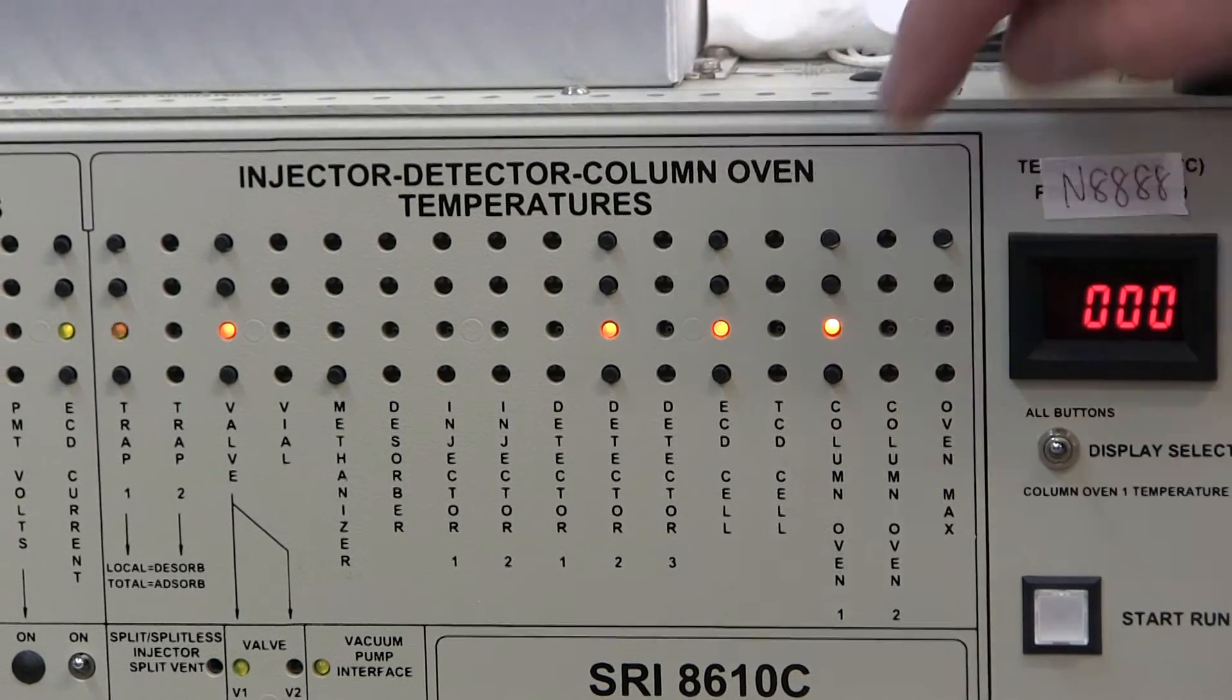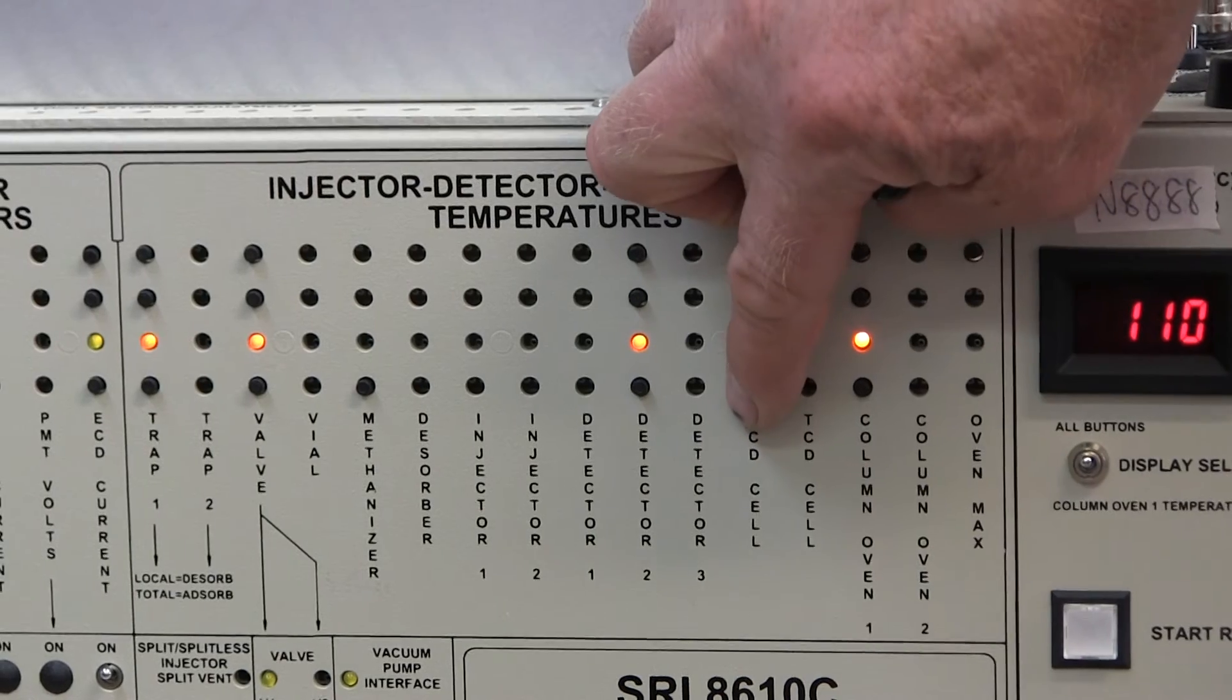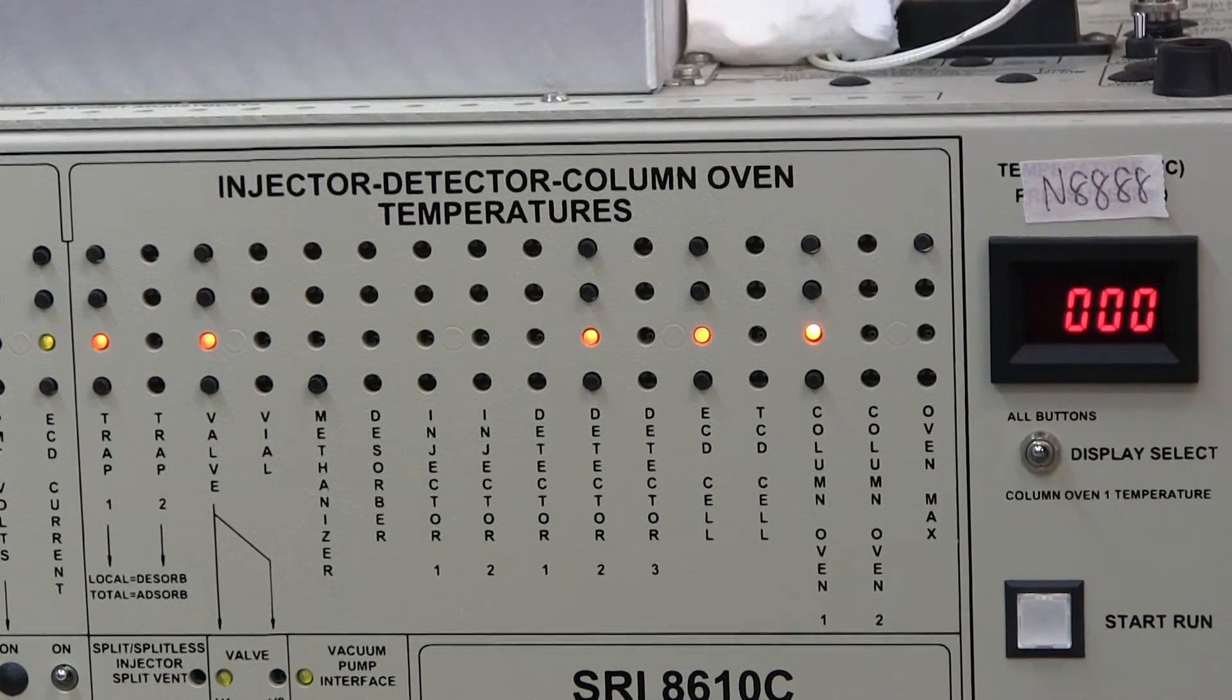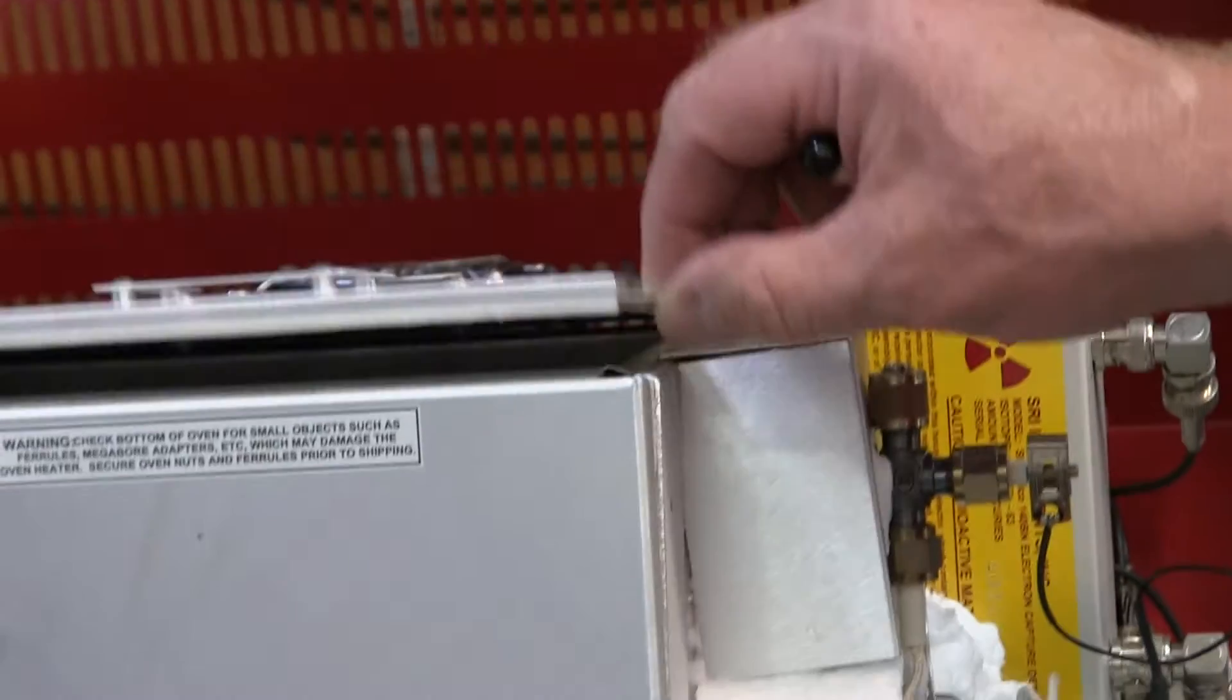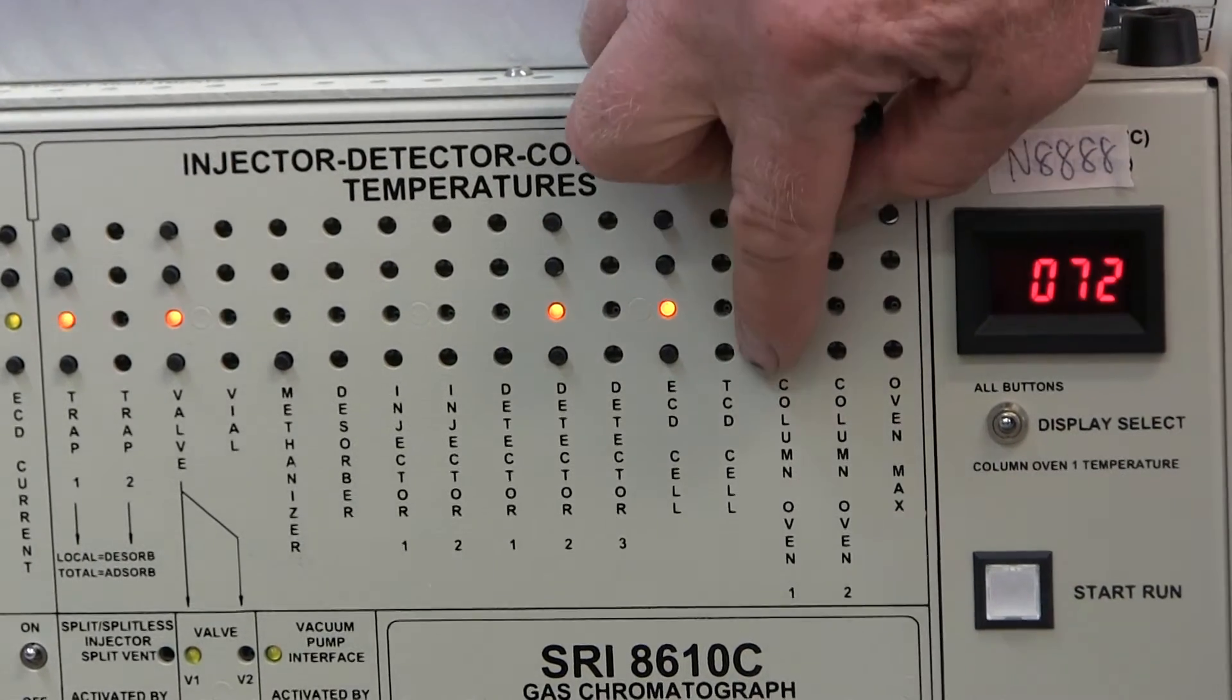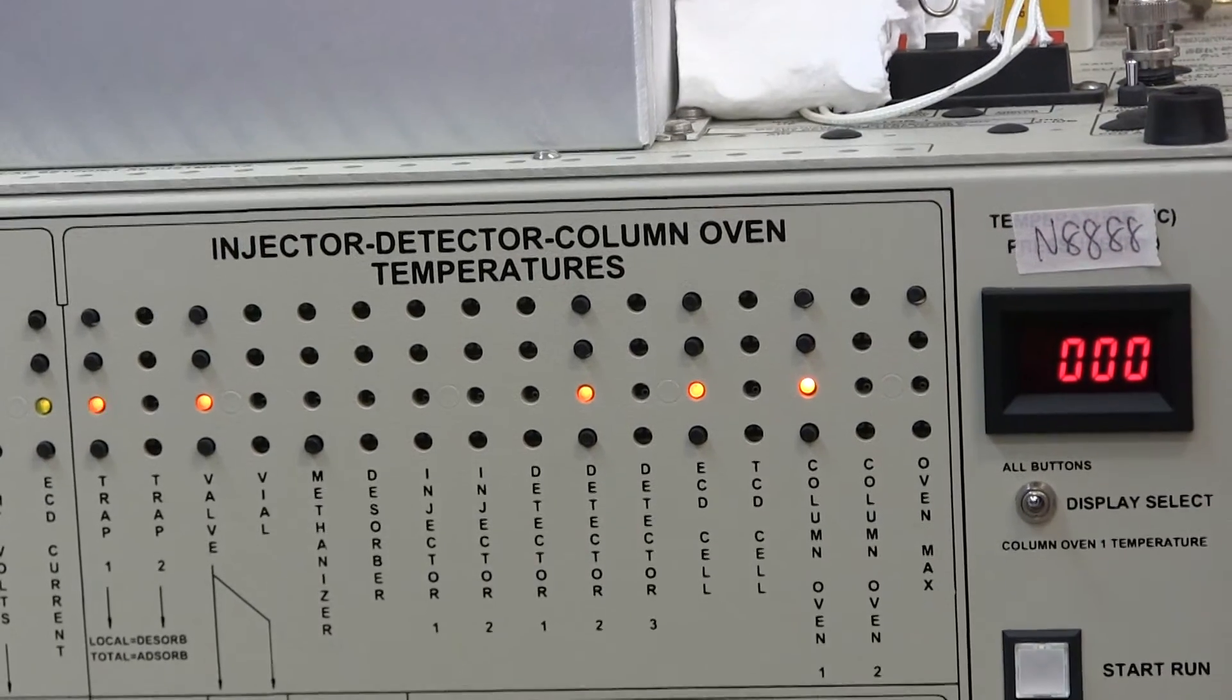The electron capture detector set point temperature is 252, the actual temperature is 110. So it's also in the process of heating up. The column oven, where the column lives, the set point temperature is 100, the actual temperature is 62. So it's also in the process of heating up.